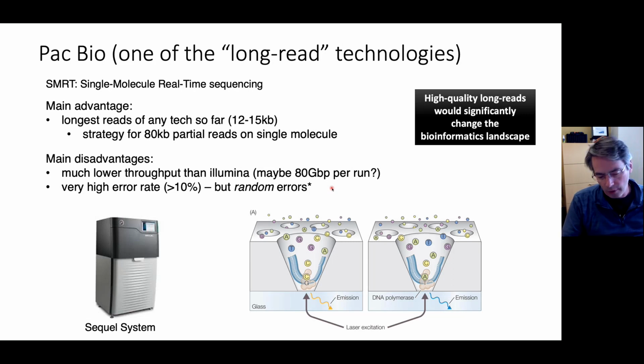So when you have a run of 5, some of the sequences will say it's only 4, some will say it's 5. So you get those kinds of errors. Those are biased errors that this PacBio sequencing doesn't have. So you need less coverage in order to correct those errors or to see where those errors are.